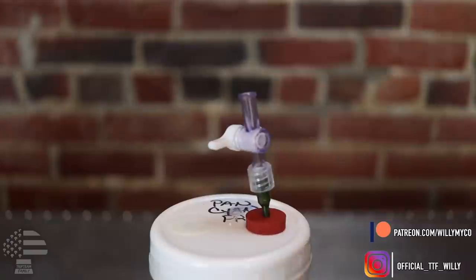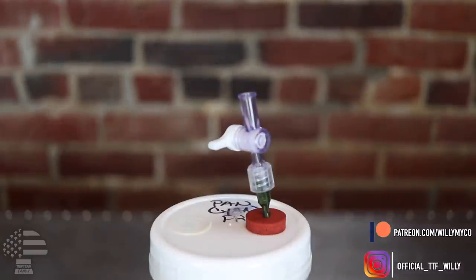Once the LC needle is inside your LC, attach the stopcock to the needle — the end that attaches to the needle. Once it's on there nice and tight, make sure your valve is closed — you do not want the valve open. Now take a strip of parafilm and go around the lid the same exact way you would an agar dish. Once you have the parafilm on there, it's pretty much done and you're ready to use it.